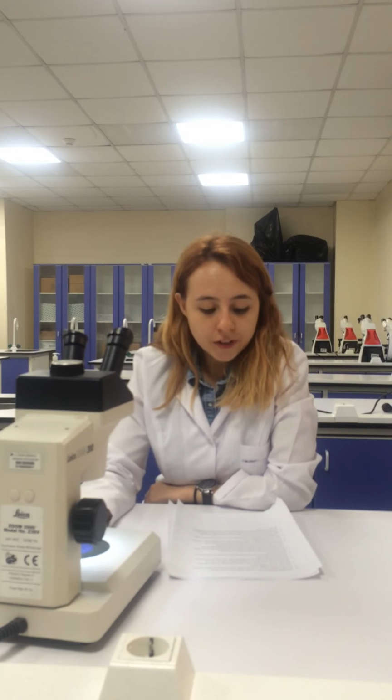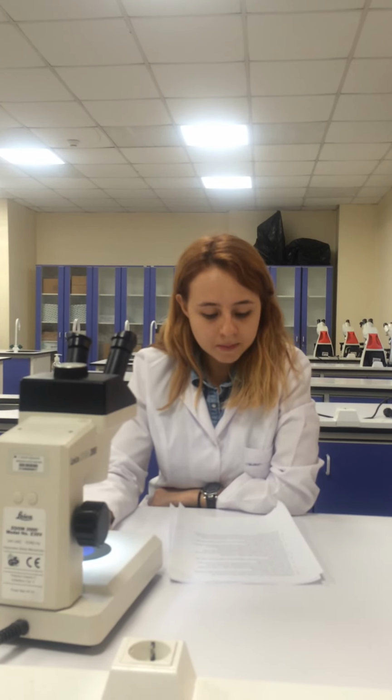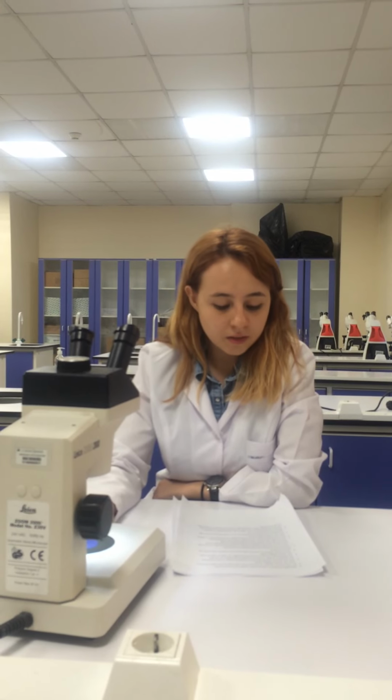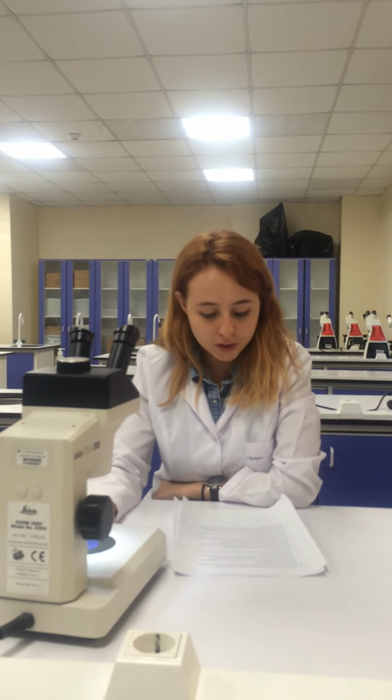And the last step is toluidine blue O staining for differentiated chondrocytes. At day 14, chondrocyte induction medium is aspirated from the 15 ml conical tube without removing the sediment of differentiated chondrocytes at the bottom of the tube, and the tube is washed twice with PBS. Chondrocytes are fixed in 10% formalin solution for at least 10 minutes, and the formalin solution is removed from each tube and the tube is washed twice with double distilled water.